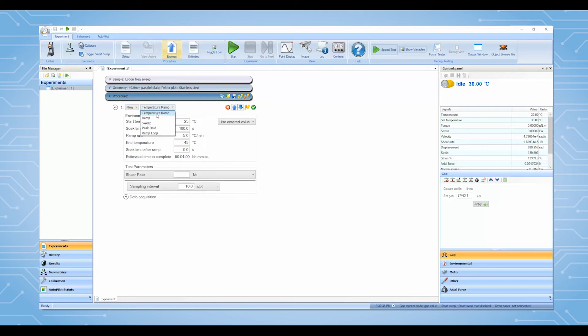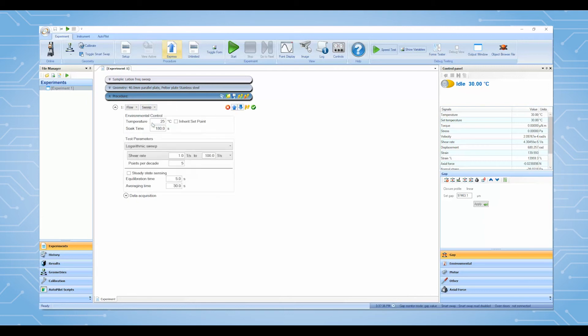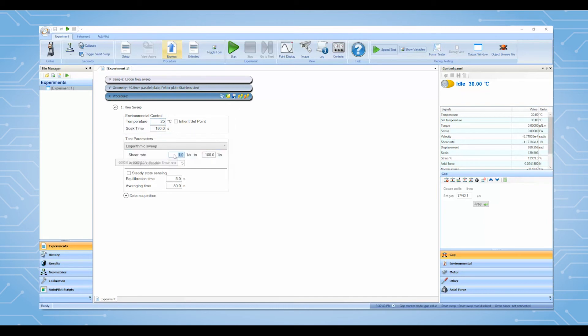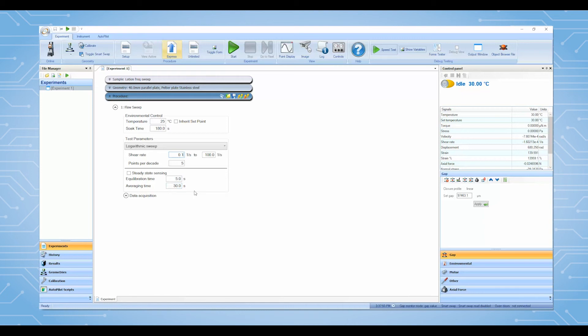In the flow sweep procedure, you only need to enter your test temperature and the shear rate range. The default equilibration time and averaging time are good to use for most common samples. If you want to ensure that each data point is collected under steady state, check the box for steady state sensing.